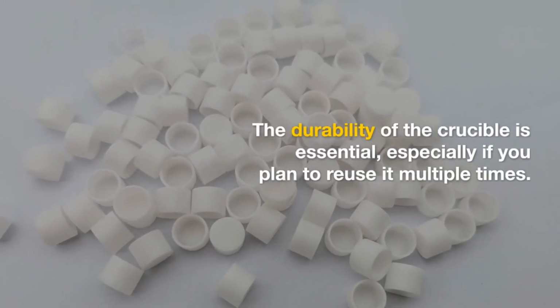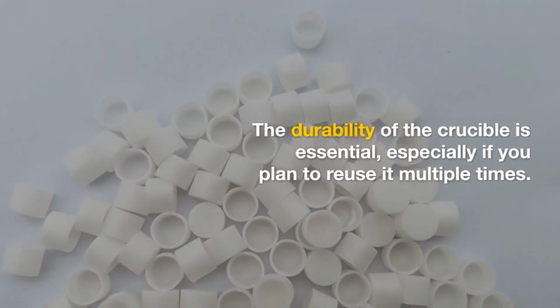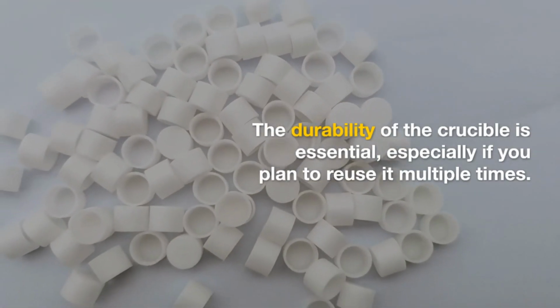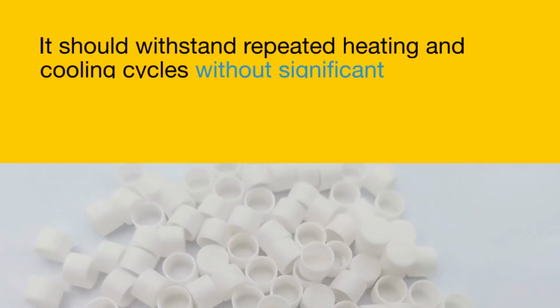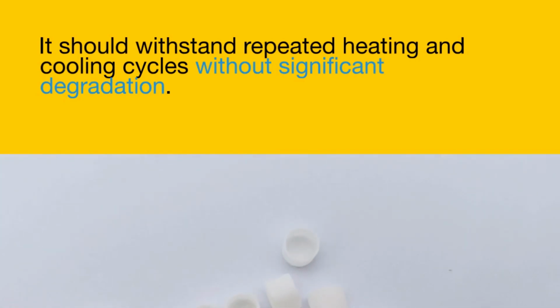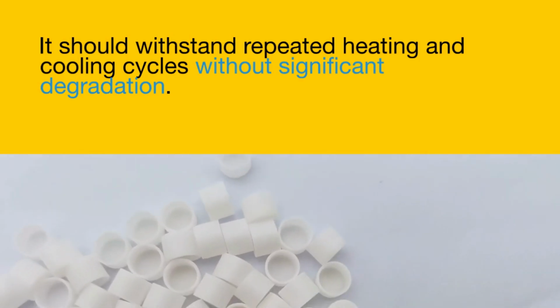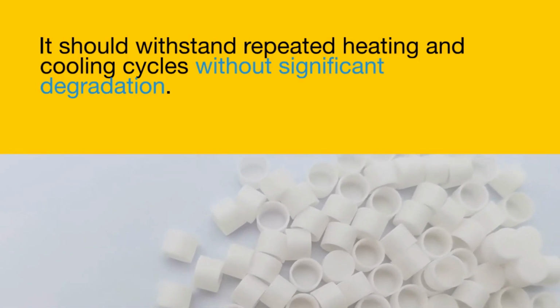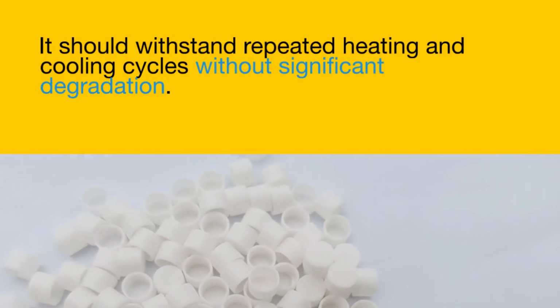The fourth, crucible durability. The durability of the crucible is essential, especially if you plan to reuse it multiple times. It should withstand repeated heating and cooling cycles without significant degradation. Consider the long-term durability of the crucible material to ensure its longevity and cost-effectiveness.